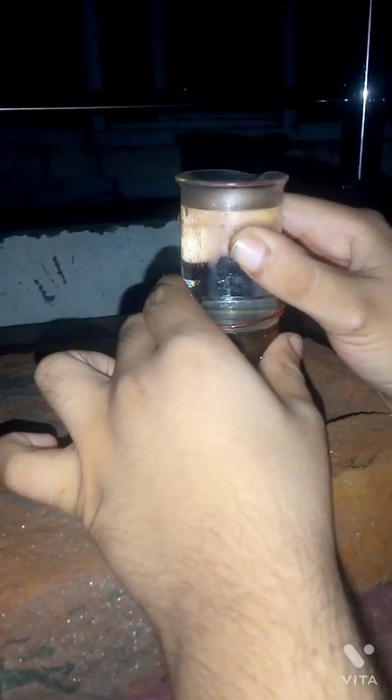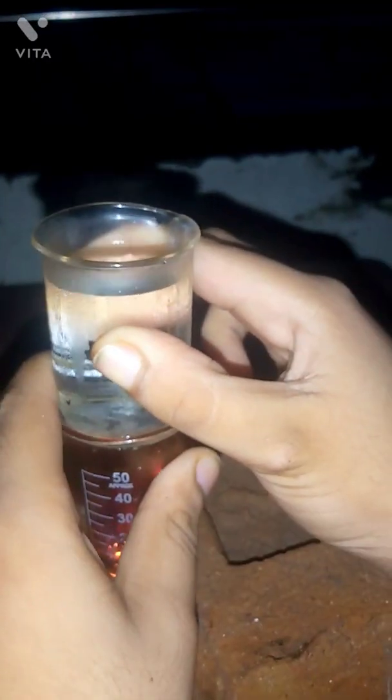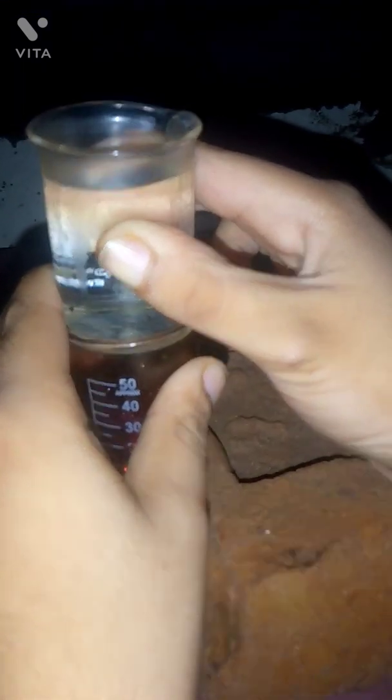Now the flame is running and I put my hand on top, because it is a lid which lets the pressure escape, so I do not need to release any pressure. That's why we can cover it and heat the beaker for some time until all the iodine is sublimated.